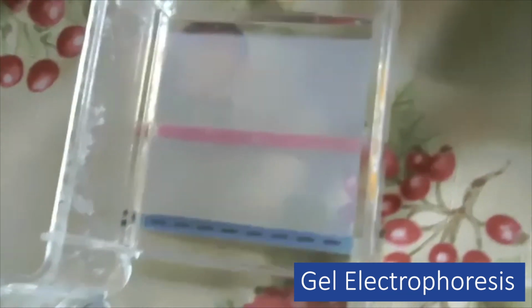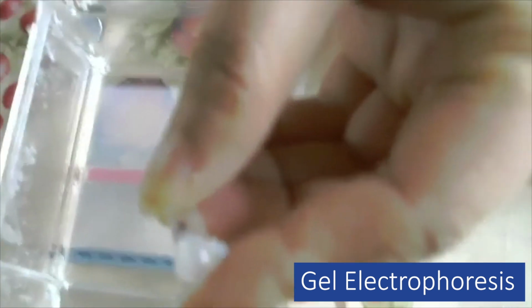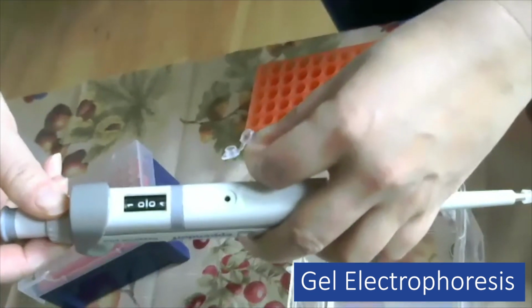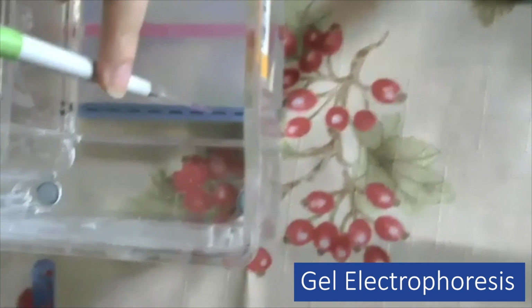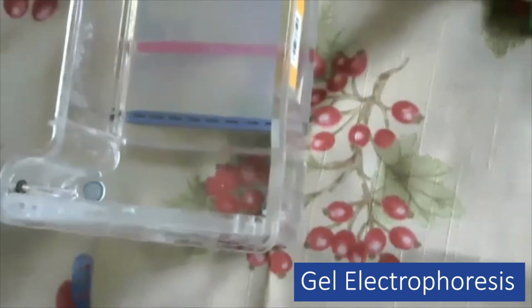So the second thing you're going to load is your uncut, undigested sample, the PCR product, okay? You labeled U on the side of the tube, right? Okay, so we're going to load 10 microliters of that into the gel. 10 microliters is 1000. All right, you press down to the first stop, you get all the sample out, and then you aim to that specific place and press down to the first stop. When you load the gel, you only press to the first stop, okay?